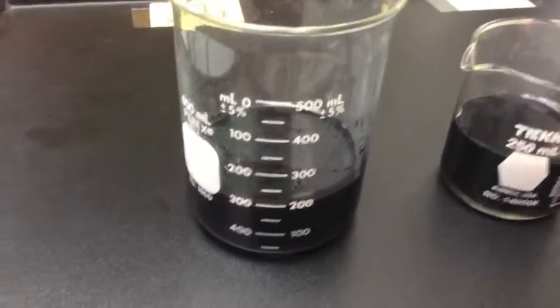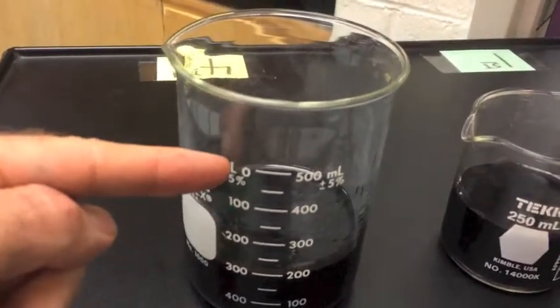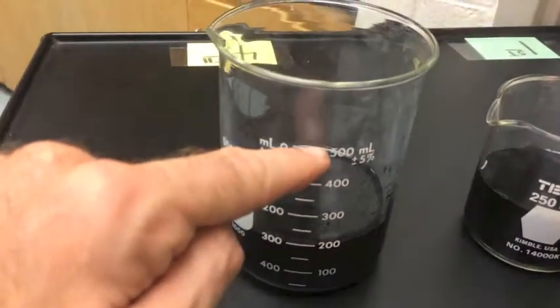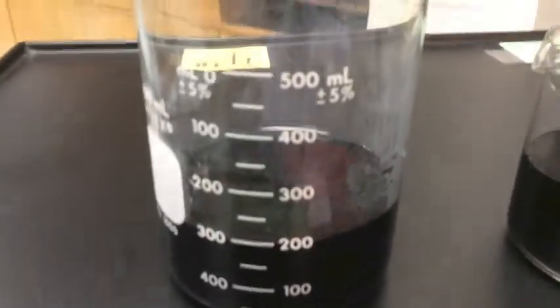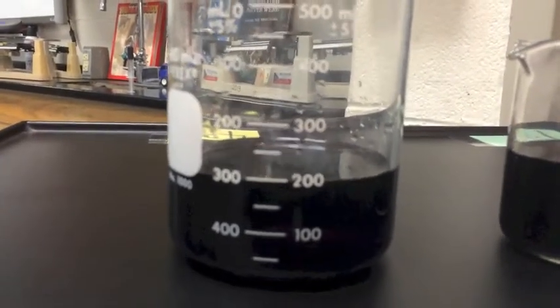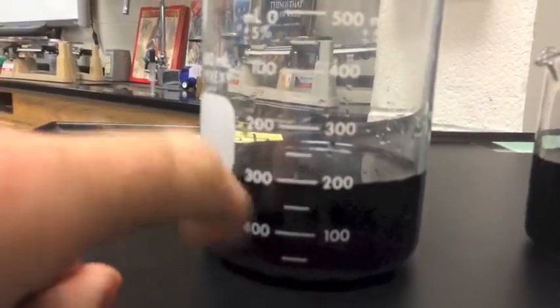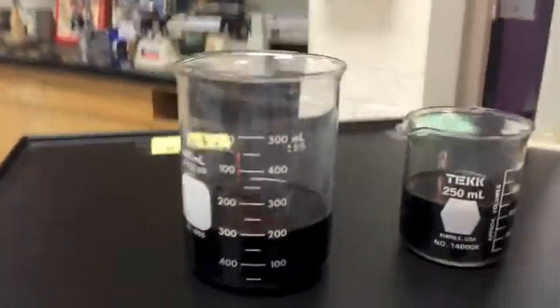So if I look at this, I'm going to see two different sets. You're going to notice that this set goes from larger to smaller as it goes up. This set here goes from smaller up to larger. This is the set we want, going from smaller to larger. If you look at the color of the water I put in, as I get down on the edge and look very closely, we can see going up this side, the graduations go from 100 to 200, and that, of course, would be milliliters, like we've always measured.